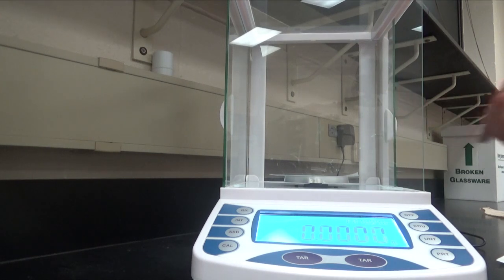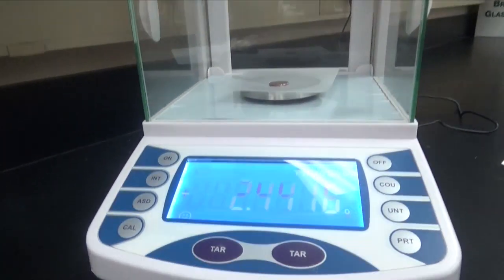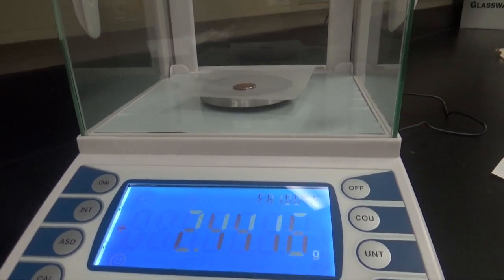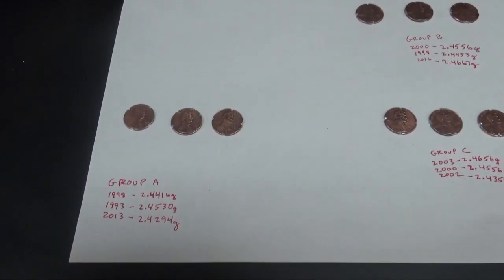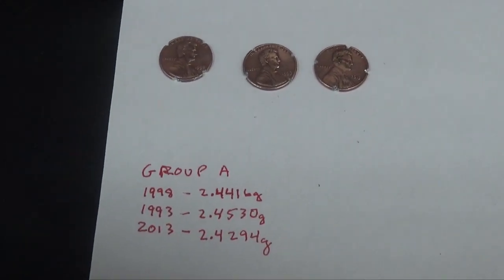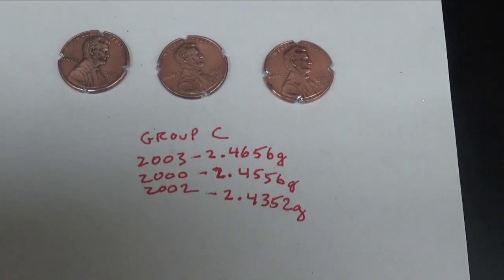I'll now use forceps and drop the first penny on there and close this. And once the numbers stop moving and the g pops up, 2.4416. Notice I've written 2.4416 next to the date of the penny I just massed. So I weighed all the pennies and I've written their masses for group A. Group B. And group C.